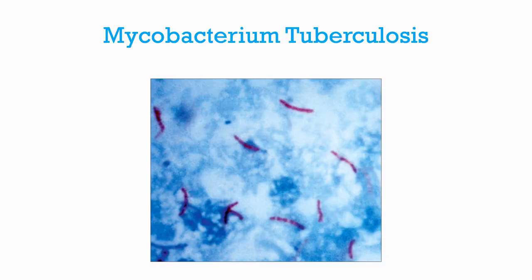Let us see how some of the commonly found acid-fast organisms or cells appear under the microscope after acid-fast staining. The method described in this video is mainly used for Mycobacterium tuberculosis and non-tubercular mycobacteria. For other acid-fast cells, we need some modifications in the decolorizing agent. This picture shows pink tubercular bacilli that appear thin with a beaded appearance on ZN staining. They may appear singly or in clumps.